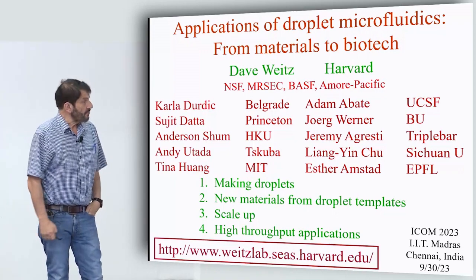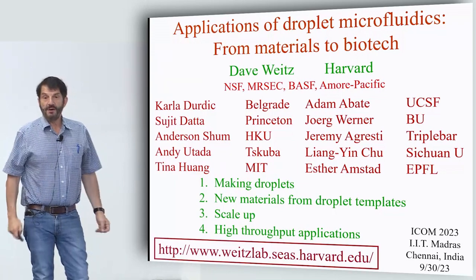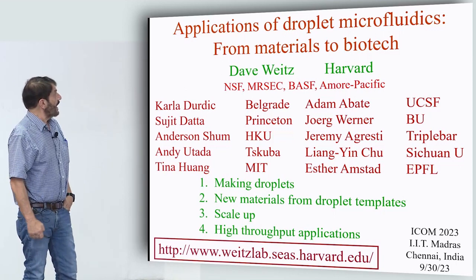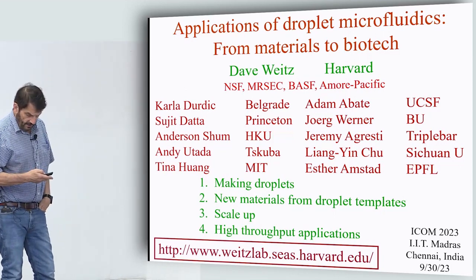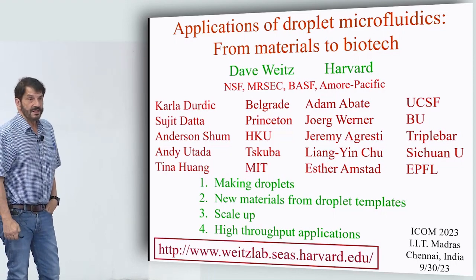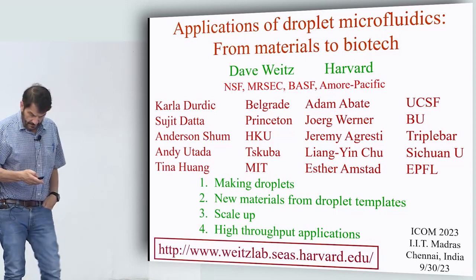So, watch my time. Today I want to describe various applications of microfluidics. I'm going to talk about droplet microfluidics in particular. I'm going to talk about two generic applications, both materials and biotechnological applications. And let me say at the outset that all the work is done by many, many collaborators, students and postdocs who've been working with me in my lab over the years.